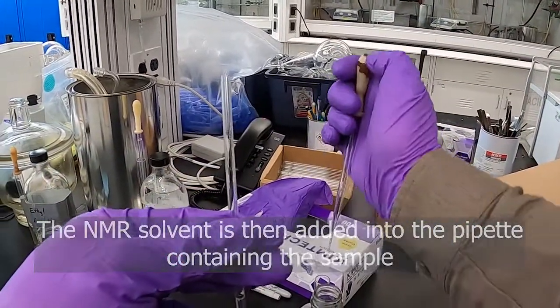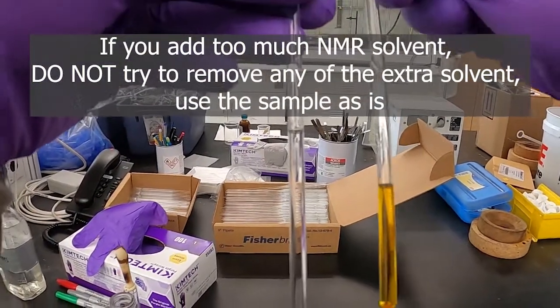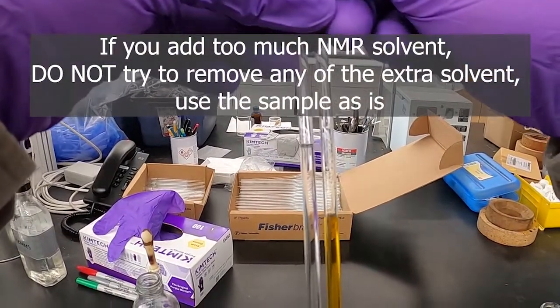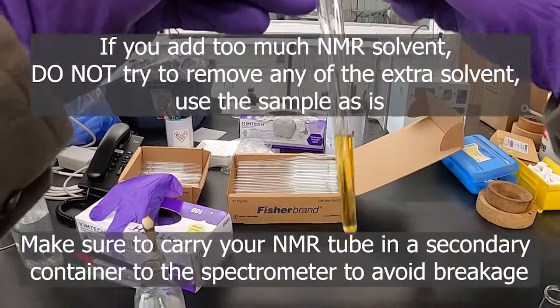I've added too much now — you see that's too much, it's really easy to go over. That's almost double what we need. So add it slowly and you won't go over.